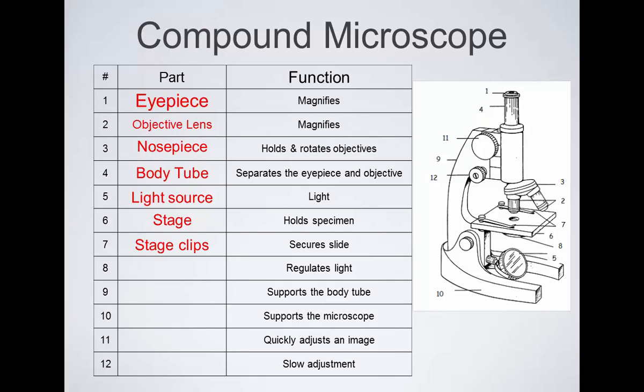So you don't have to move it around with your fingers like you would with that microscope. You actually use these knobs to move it, and it allows you to move it much more slowly in a much more controlled way. Because sometimes when you're looking at something, if you have to move it with your fingers, you move it too much, and it comes out of view. So this is a nice system that we have on these microscopes, but it's not shown here.